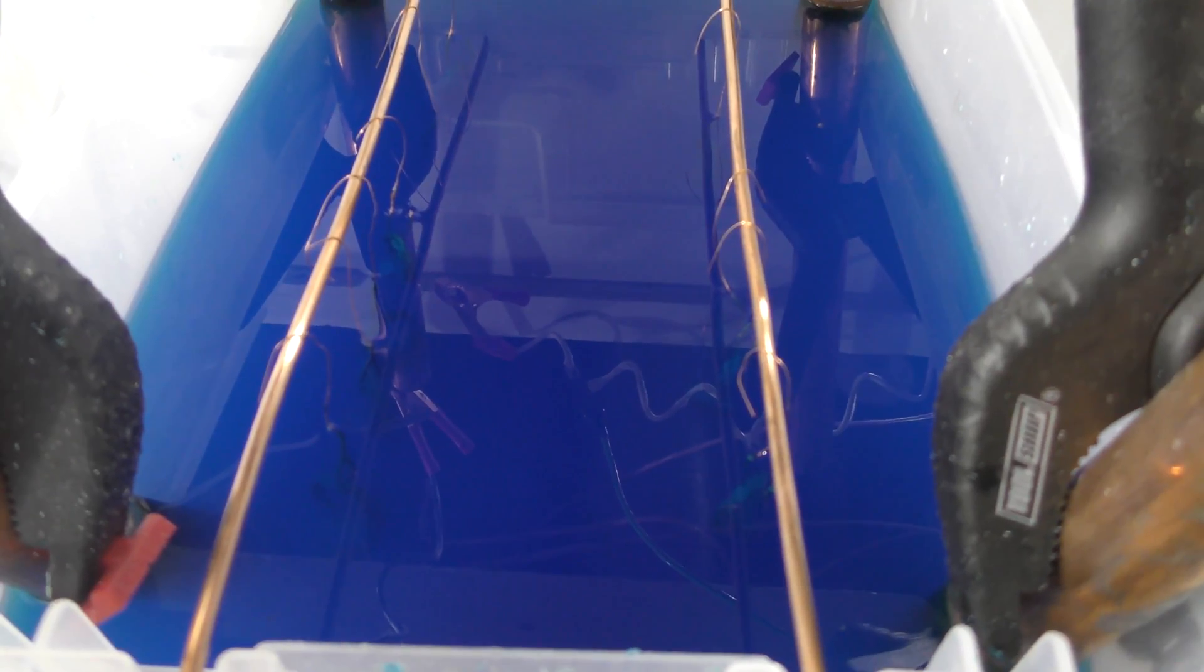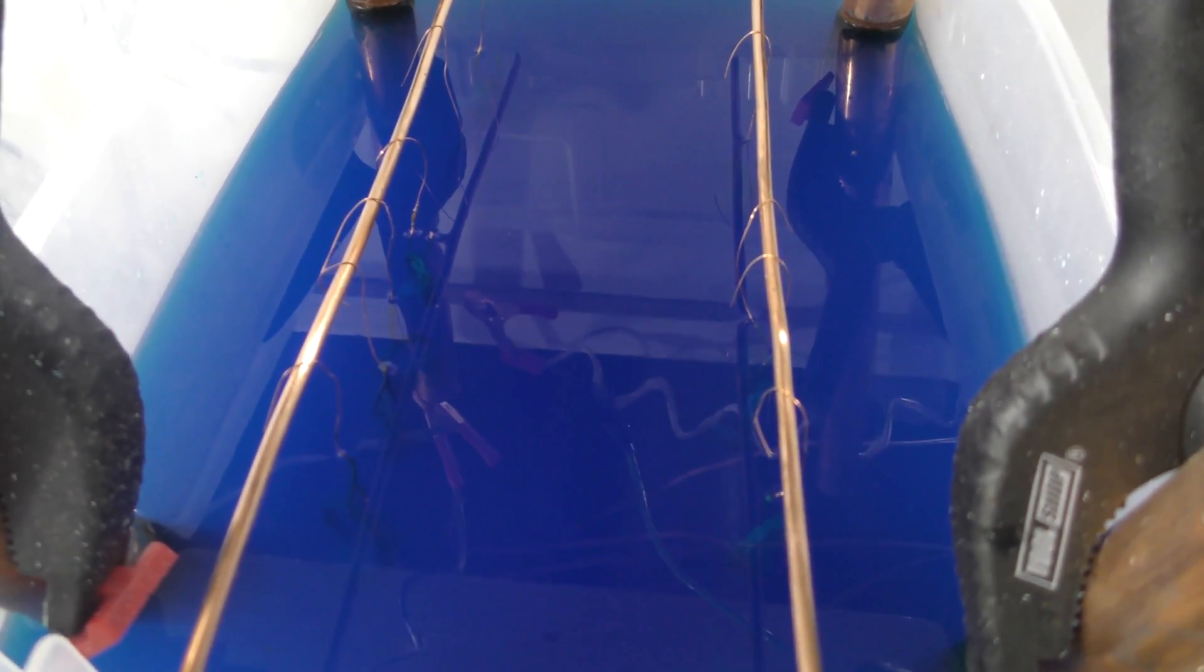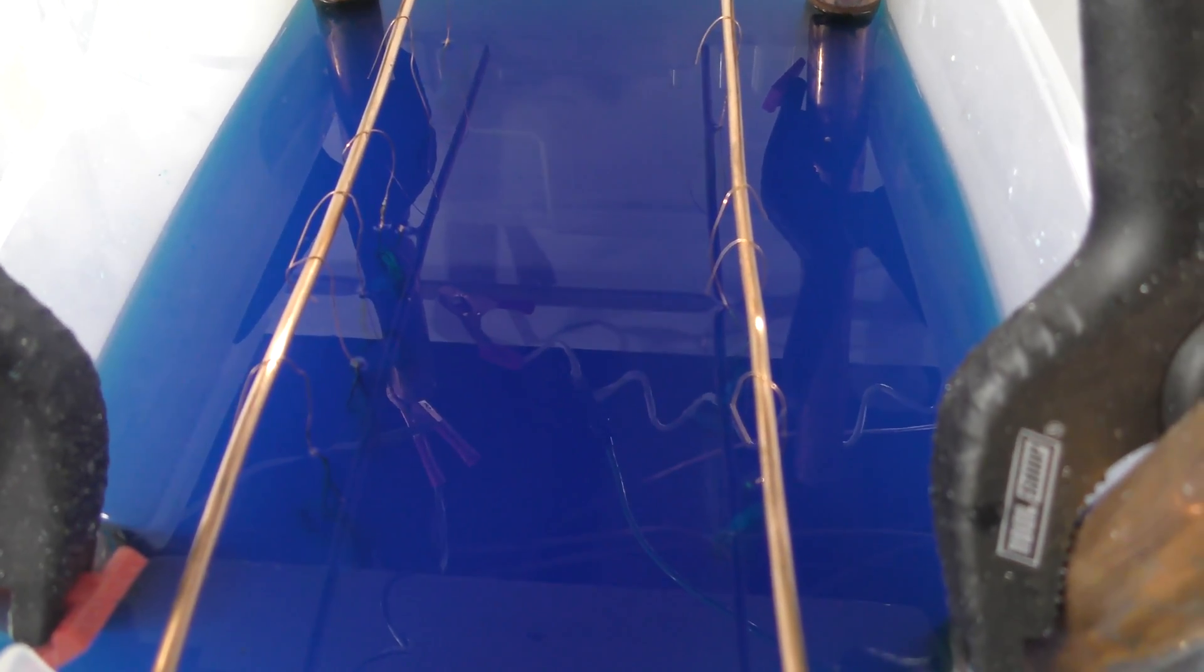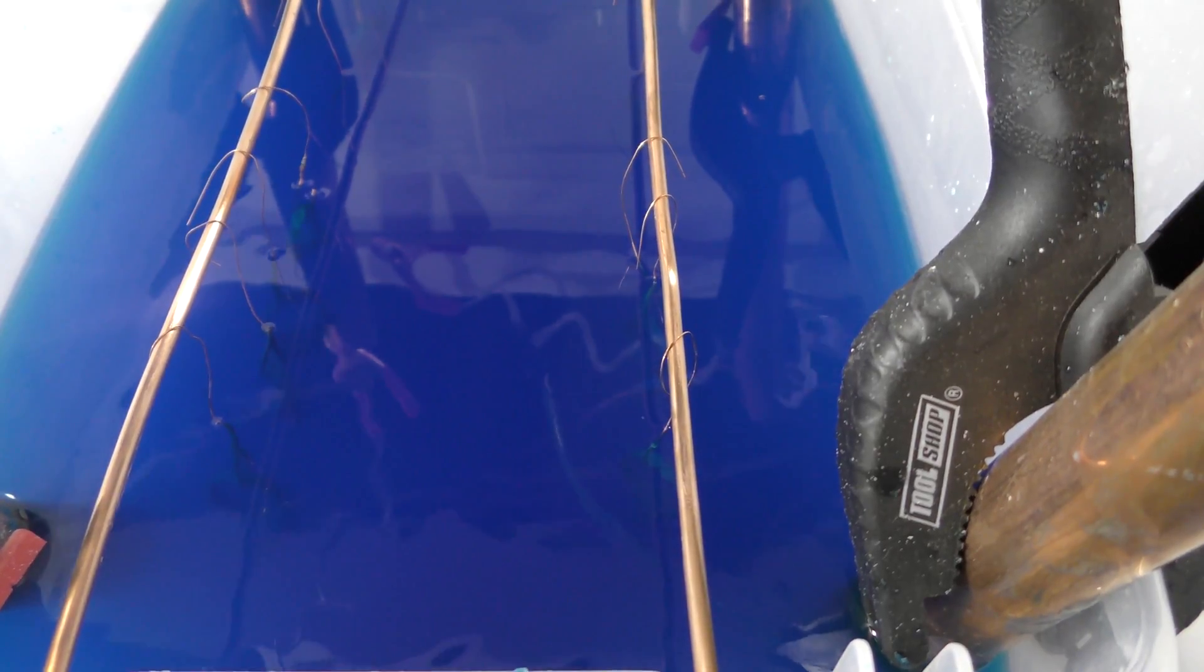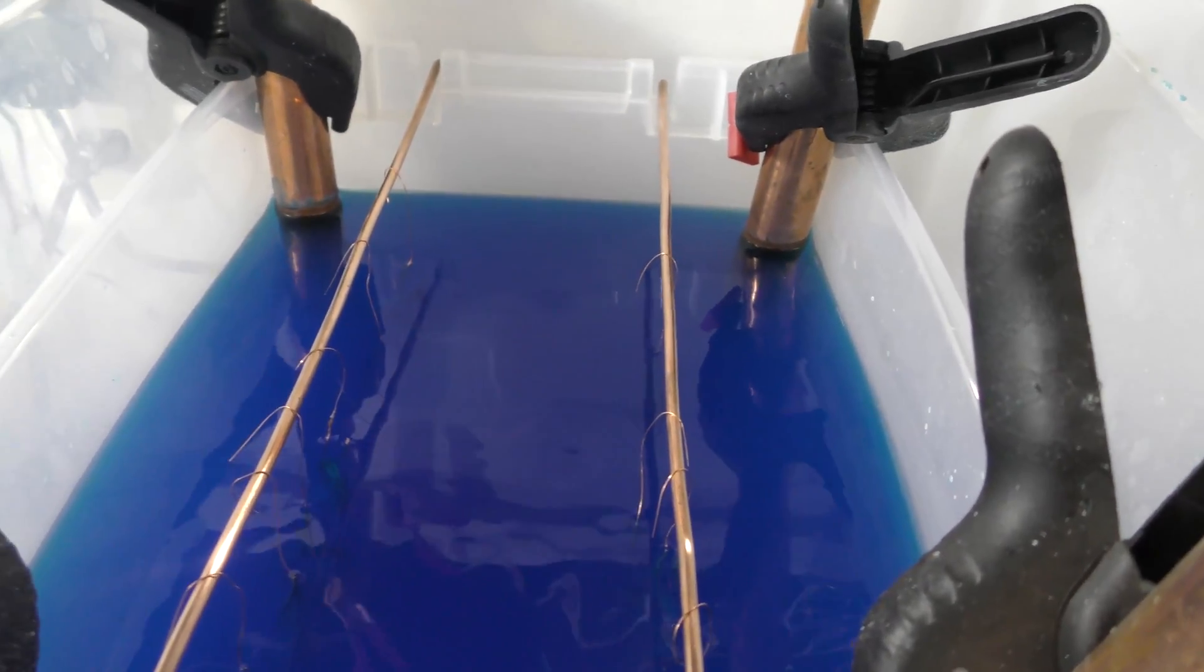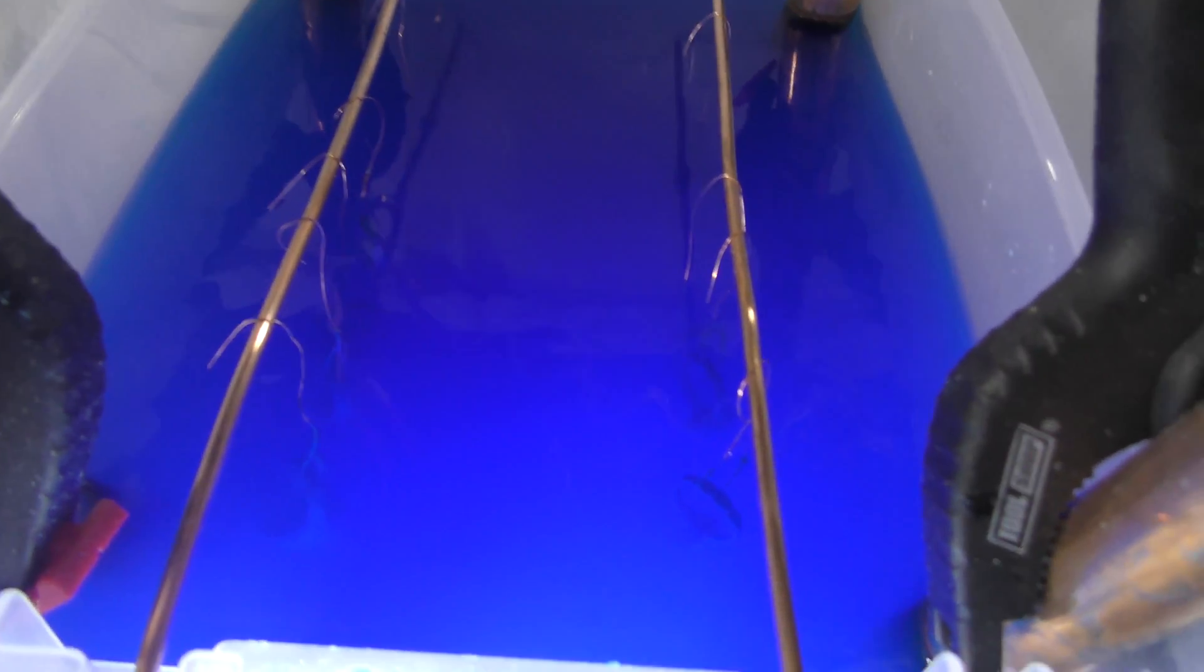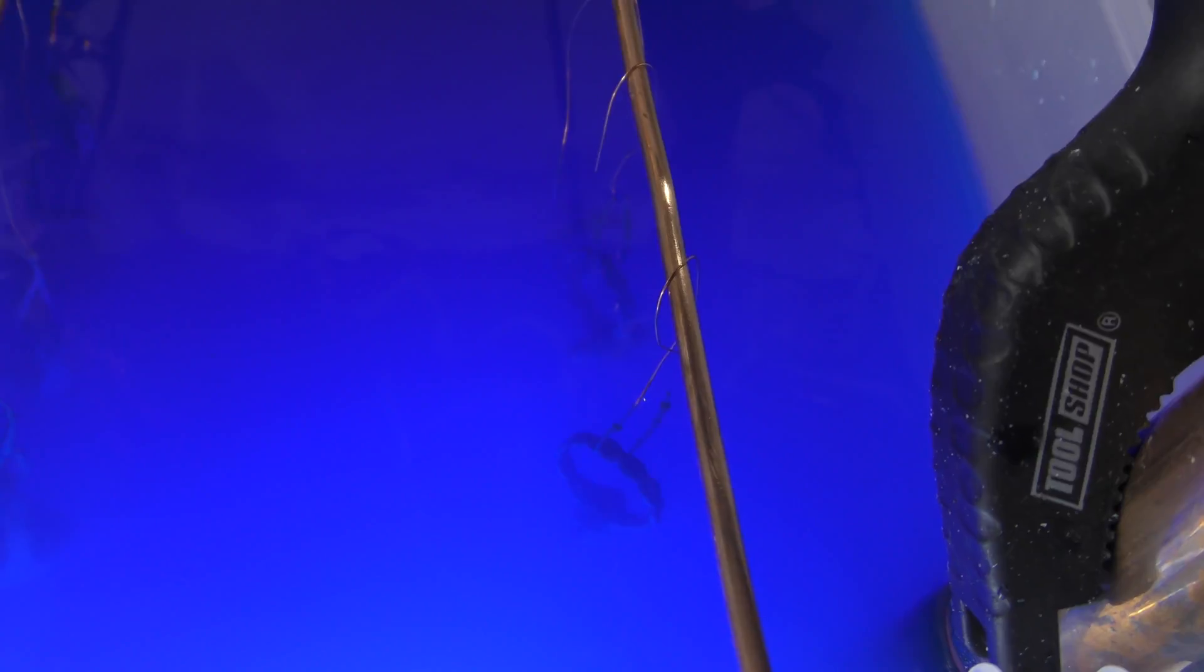So I've got this pill. This is the pill it comes with. I'm going to turn this bad boy all the way up. Then I've got this flashlight to show you what's going on in here. And you can see those rings are shaking back and forth. Very cool.